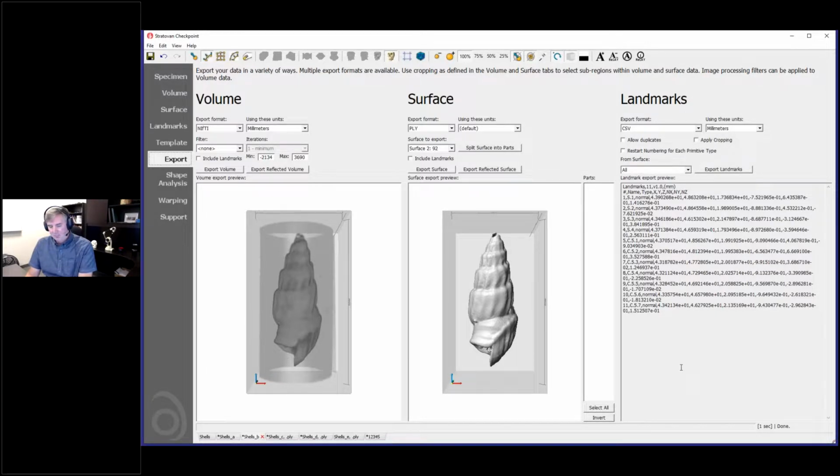That definitely stretches my statistics capabilities and very much gets into the background and training that the folks that use these tools know really well. So it's almost better to talk to some of our customers that use the software on how to do the analysis than us in particular. I don't know if that's a good answer to that question, but.